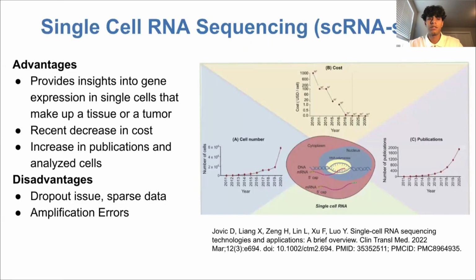I would like to first introduce some motivation about developing a workflow for single-cell RNA sequencing. Single-cell RNA sequencing is used to measure mRNA gene expression levels in individual cells in a tissue sample. Data is then used to better understand tissue composition and the variability of gene expression across cell populations. As we can see by the picture, the application of single-cell RNA sequencing has been rapidly growing while cost has been decreasing. But single-cell RNA sequencing does pose its disadvantages, as single-cell RNA sequence data can have a lot of missing values since there's not enough mRNA molecules for each gene in each cell.